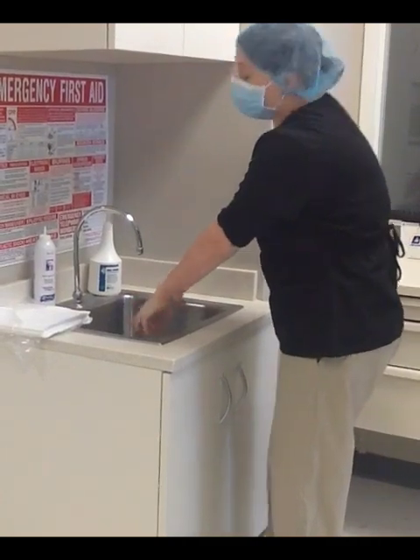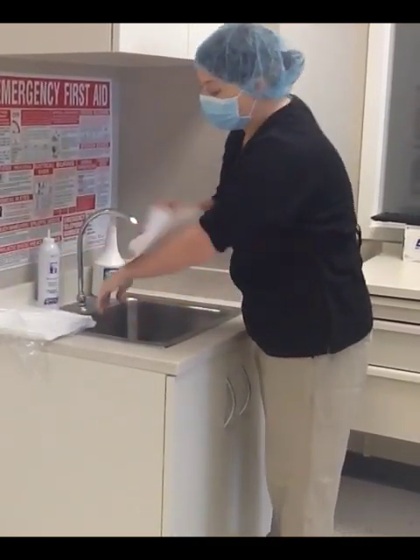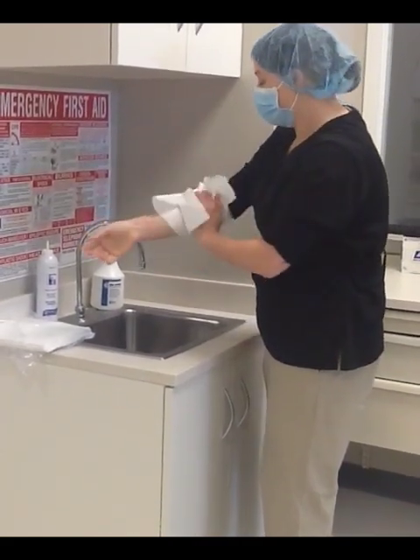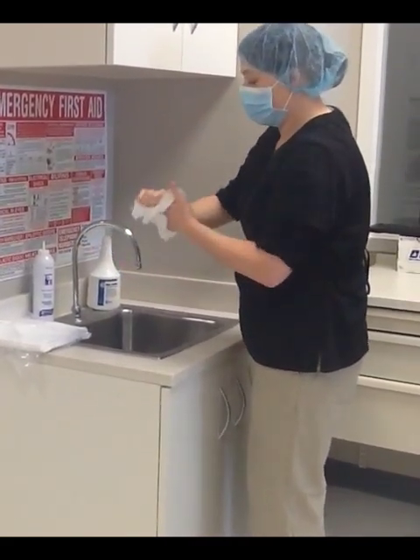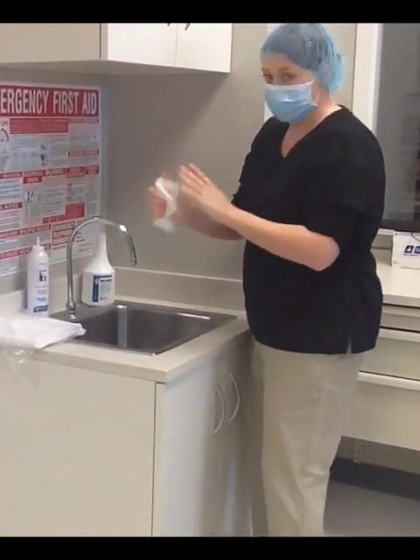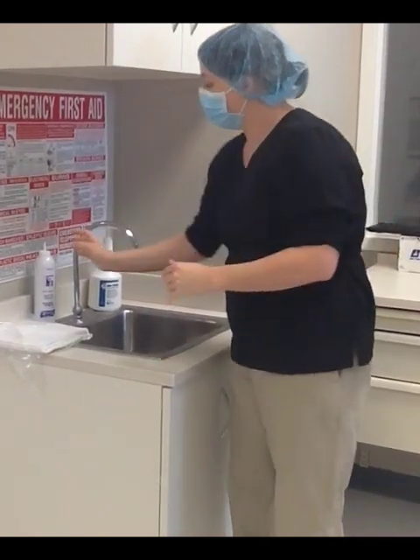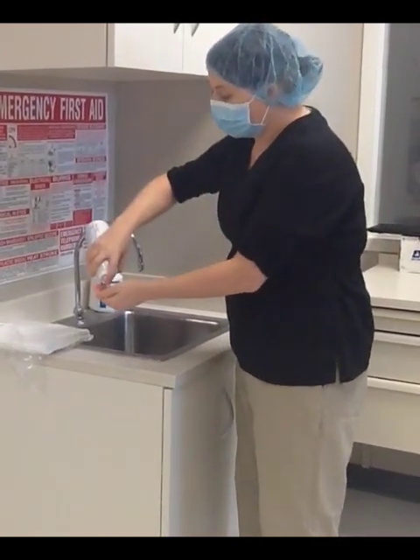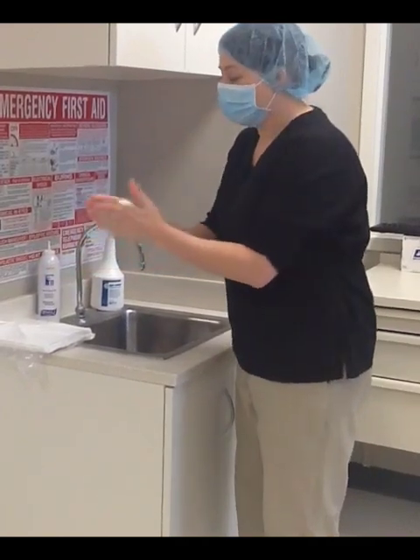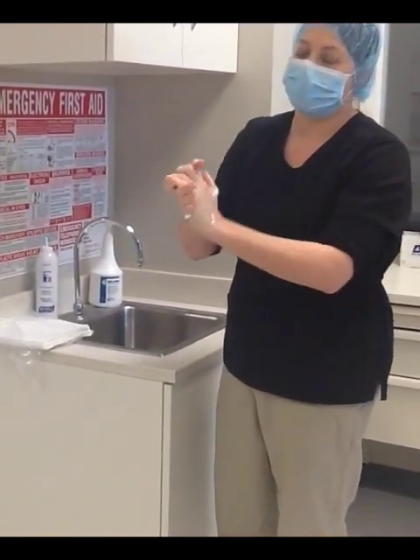Then you will go ahead and rinse. To dry, you will use a lint-free paper towel — some facilities have electric hand dryers. After you dry, you will use an agent with alcohol. Once that is soaked in, you are ready to continue your garbing.